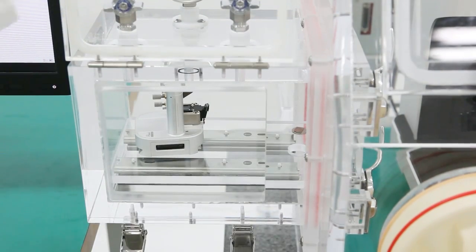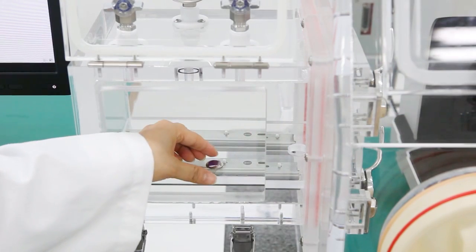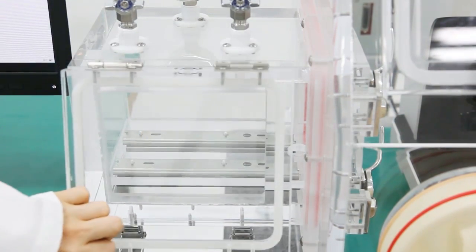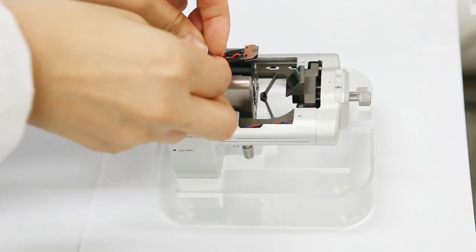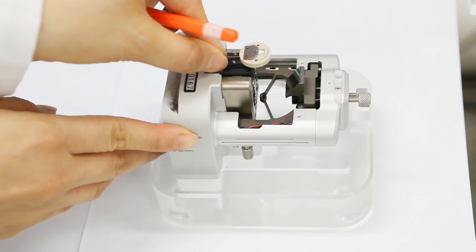Then open the antechamber's door to remove the sample as well as the head in order to change to another cantilever. Here, we will switch to a liquid probe hand for liquid imaging.